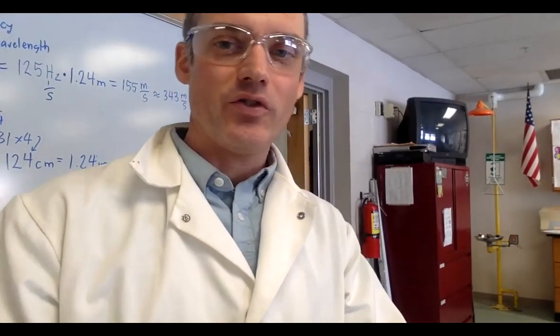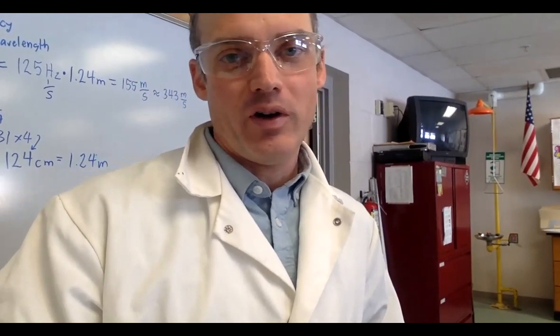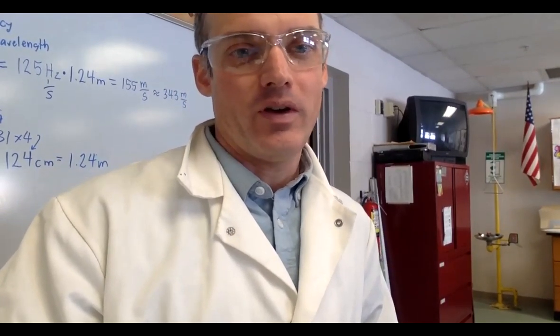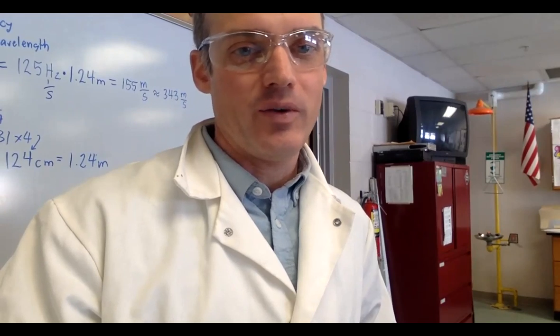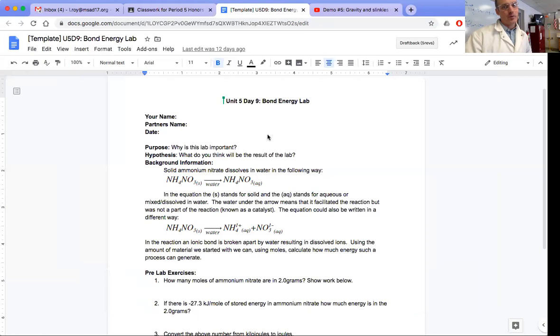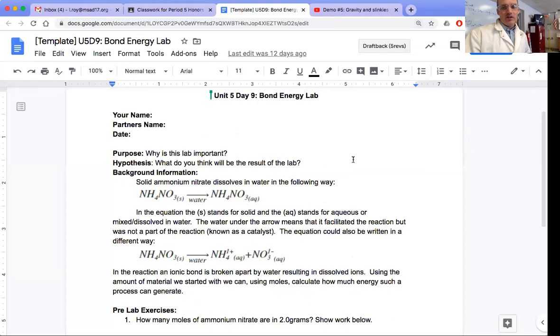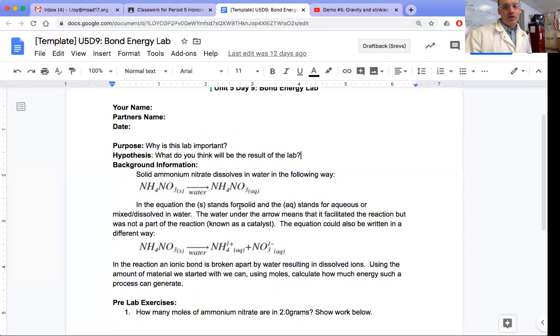Hello, so we're going to do a quick walkthrough of the bond energy lab. In our unit, we had an opportunity to do a lab where there wasn't a procedure written out. This is the template. This is what you'll be turning in online. And you may not have had the chance to do the experiment, so I'm going to show it to you here real quick.